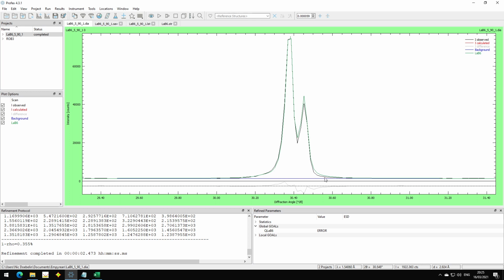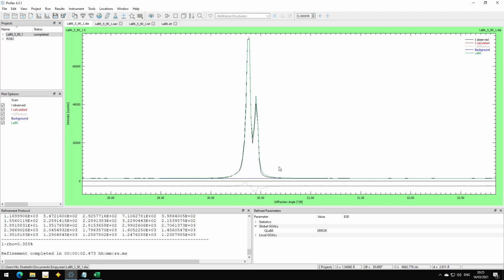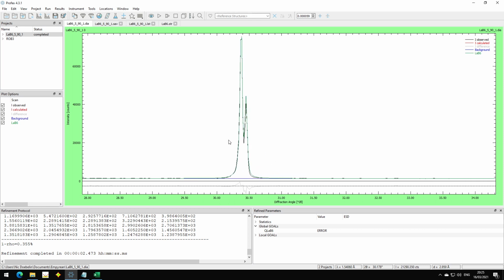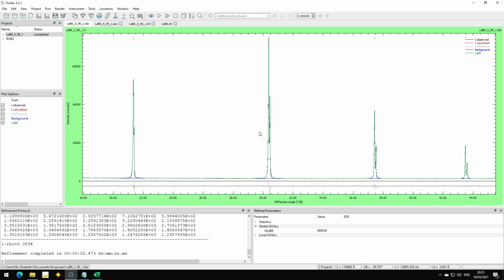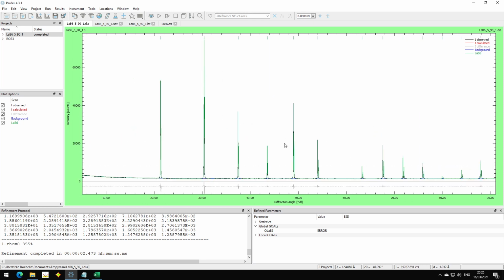We would also have to edit the wavelength distribution file, the copper lambda file, and try to eliminate this. This is a lot of guesswork, and I think the difference is pretty small. In this dataset we can see it, but in most real-life datasets we will probably not see these differences. All in all, the fit is very good, so I think we will just leave it at that.